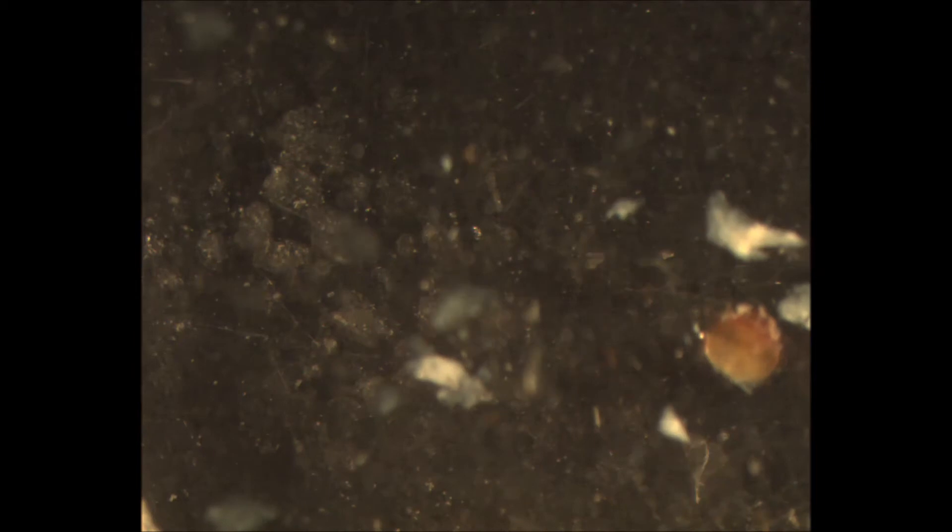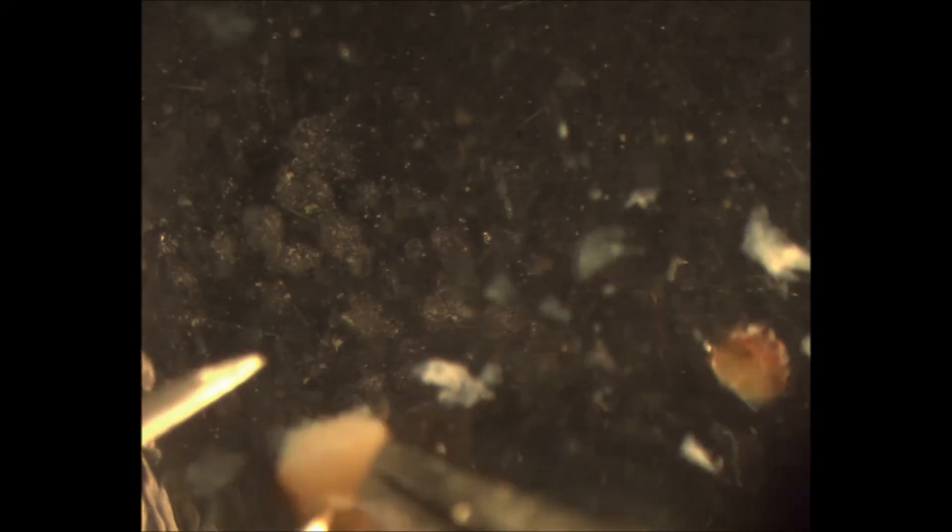The specimen has not reacted well to the KOH, so there's still lots of fatty tissue in there. I think I won't use this middle section in the slide because it will make it too opaque with all the white bits.